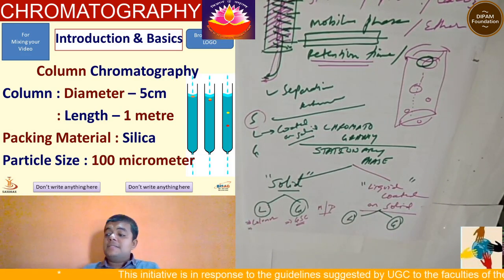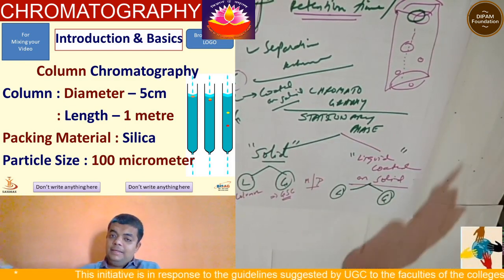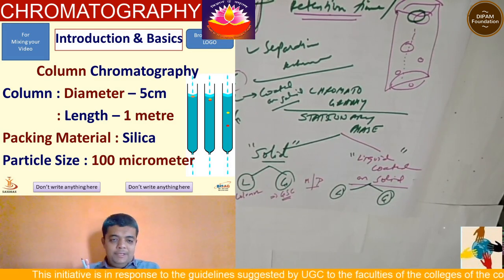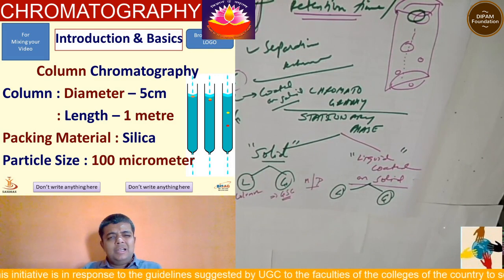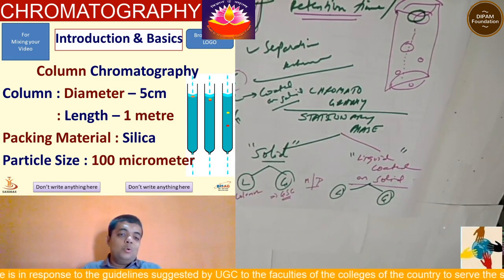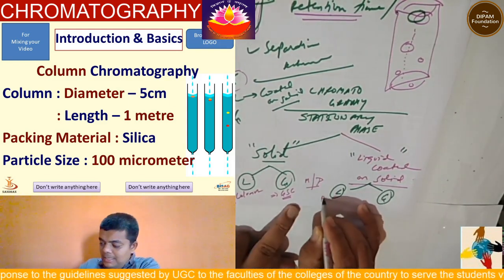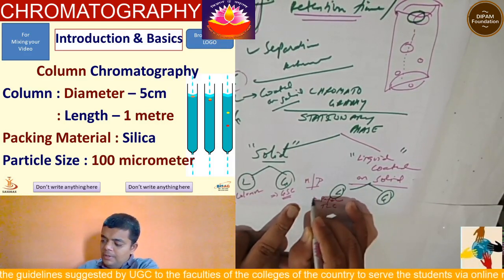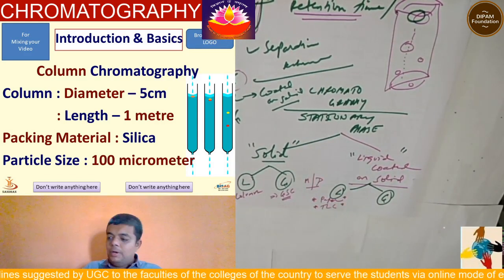Going to the opposite side, if I say that liquid coated on solid is my stationary phase and another liquid is my mobile phase, that's a liquid-liquid combination. Very rare, a little clumsy to understand, but we can understand it by using different reference books very easily along with an experimental approach. I'll get paper chromatography and thin layer chromatography, with asterisks, that is, conditions applied over this classification.